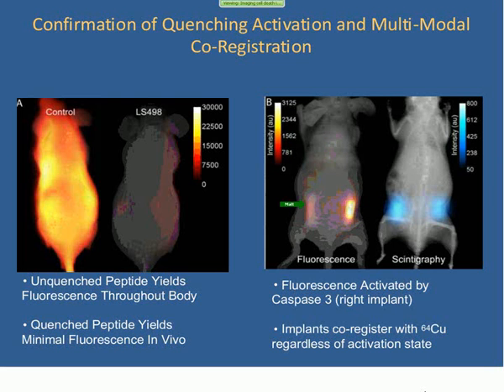Next, they performed a phantom study in which they took capsules, one with Caspase-3 included within the capsule and another one without Caspase-3. After they added the Caspase to the capsule, they subsequently added their probe. And what you can see here in the fluorescence modality is that indeed there's a great deal of activation and thus increased fluorescent signal coming from the capsule that included Caspase versus the one that did not.